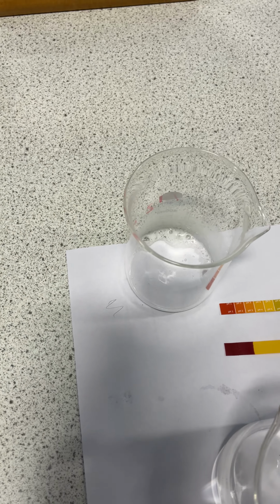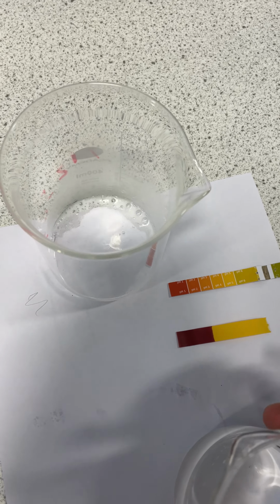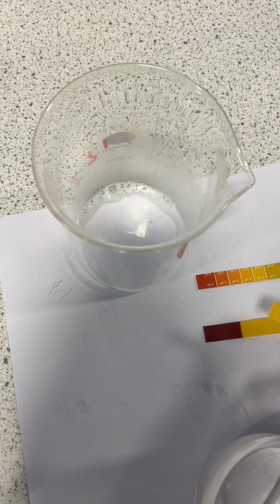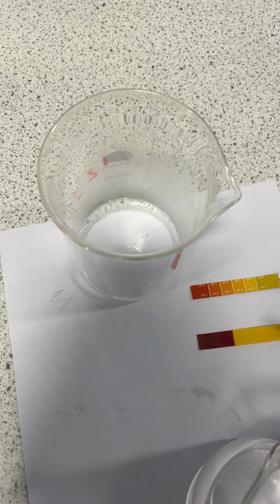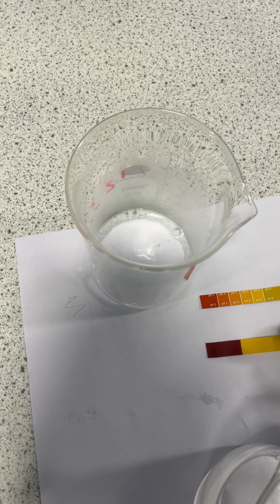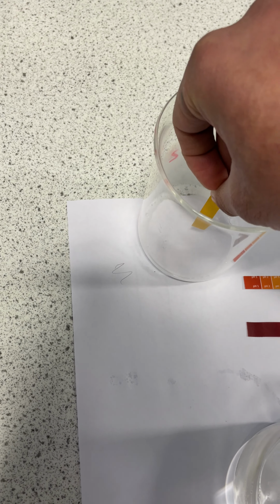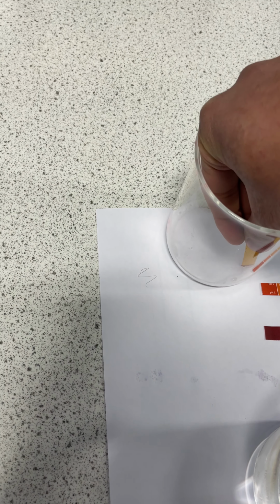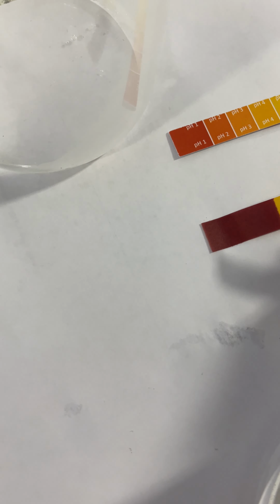Okay, let that settle. I have another bit of universal indicator paper, and if it's going to make a metal salt, we expect it not to be bright red, we expect it to be further down this end of the spectrum because the metals went in there. Now in this case, it's actually come out more of an orange than this deep red here.